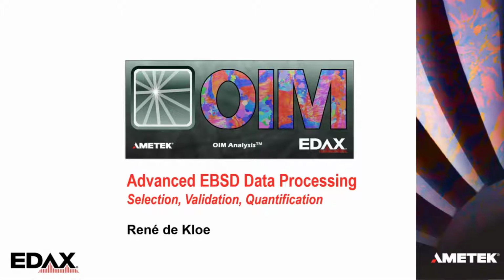Thank you very much, Michaela. Welcome, everybody. This presentation is on EBSD data processing, what you can do with the data, and maybe also a little bit what you should do with your data. So I'll be talking about selection, validation, quantification, some things to keep in mind when you are processing your EBSD results.